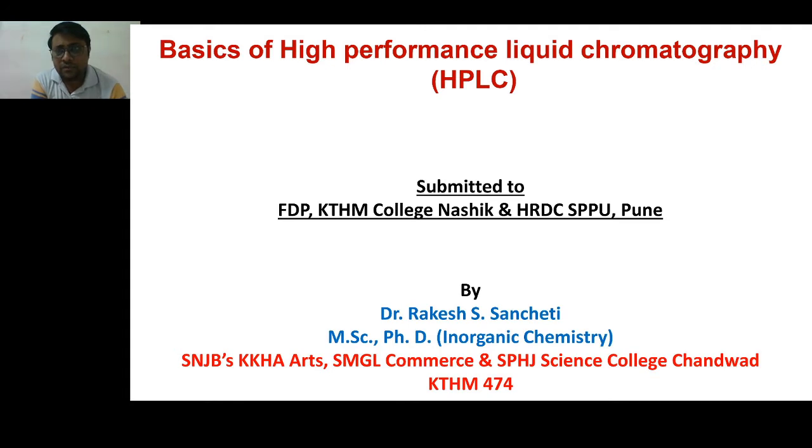Now, the meaning of chromatography is what? Chroma means color and graphy means study. So it is the study of the colors which are present in the material.